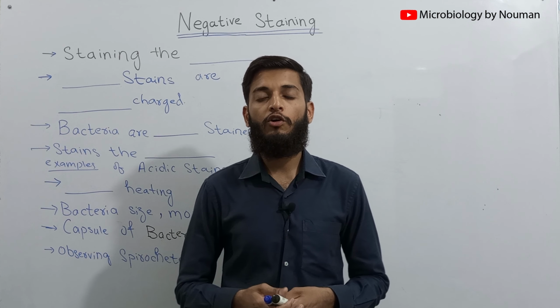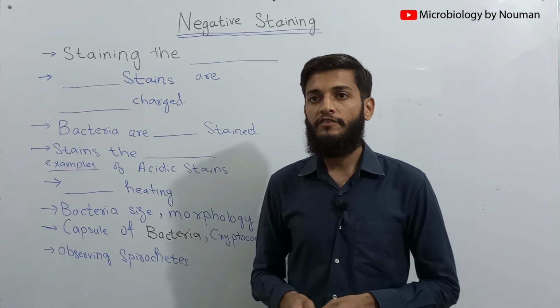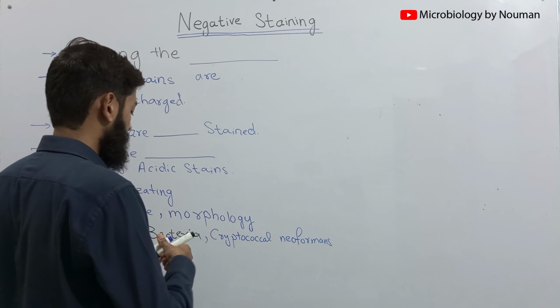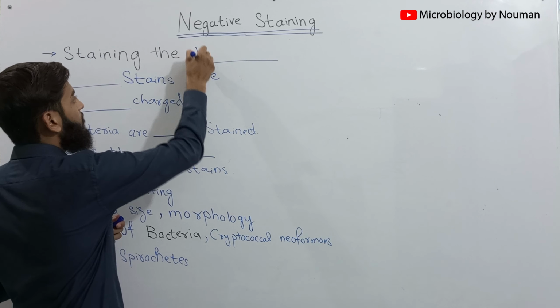In this video, we will talk about negative staining. The negative staining technique is used in microbiology for staining the background.